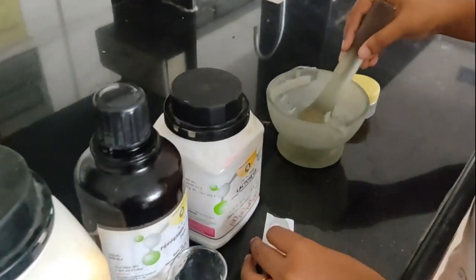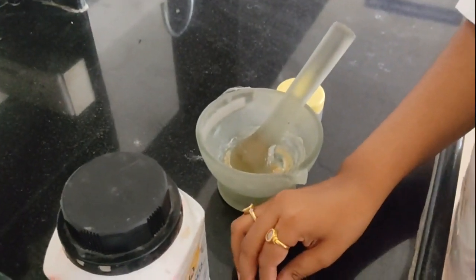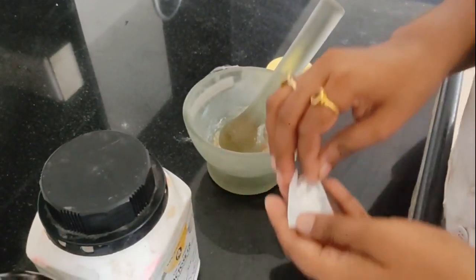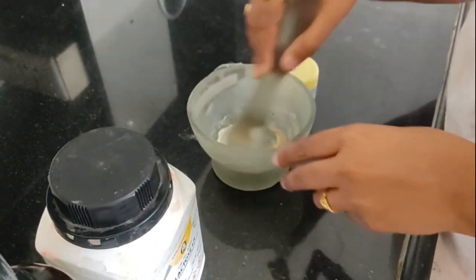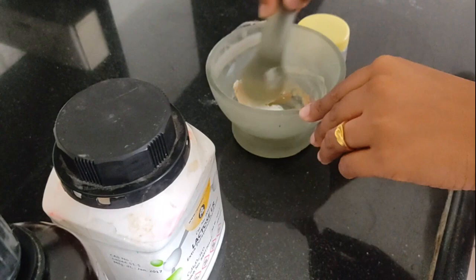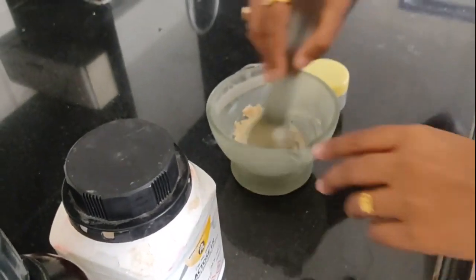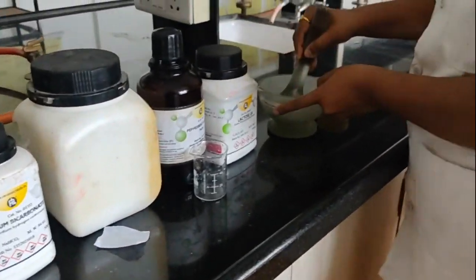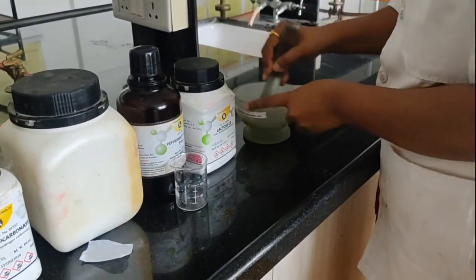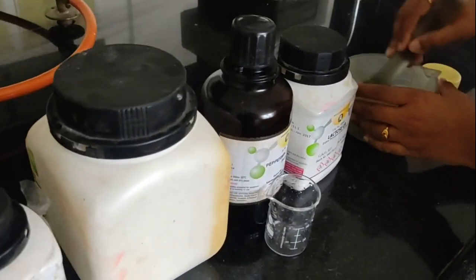After proper mixing, I am again going to add the lactose, that is the diluent, into this, and proceed for proper mixing of all of this. Triturate it properly till proper mixing is achieved.